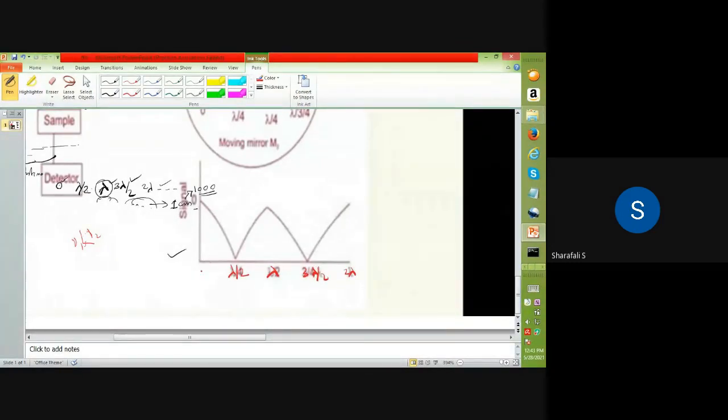So in this case, what will happen? This is your 0. In the second case, for mu2, we have a lambda that is less than that of mu1 because it has a higher frequency. Since lambda is smaller, the maximum will be at this position at 0; there is no difference. In the next case, it will come somewhere here because the lambda value is smaller, so the lambda by 2 value will also be smaller, and it will reach this point.